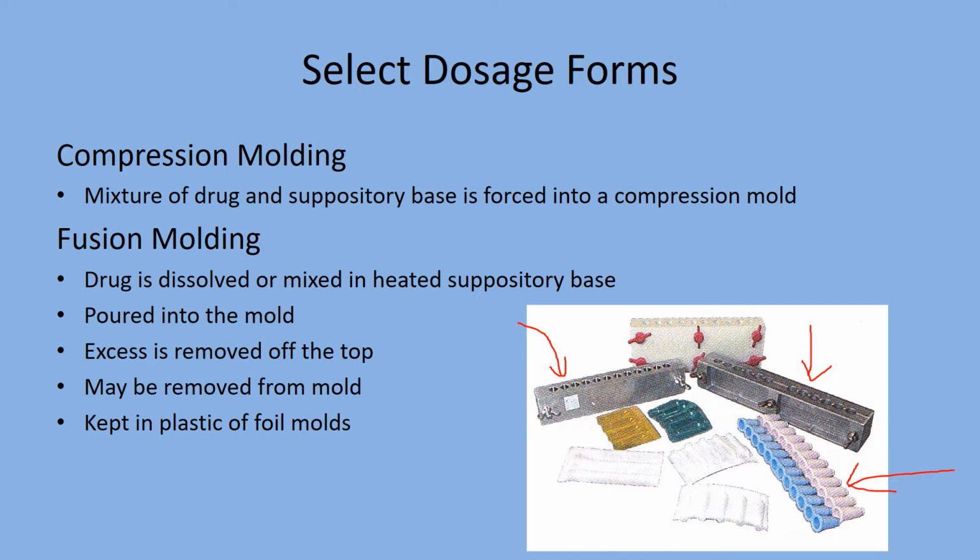Very important that you let them cool slowly. If you put them in the fridge right away, they'll shrink rapidly and they'll cause voids within the suppository. So let them cool down to room temperature first before putting them in the fridge to finish them off.